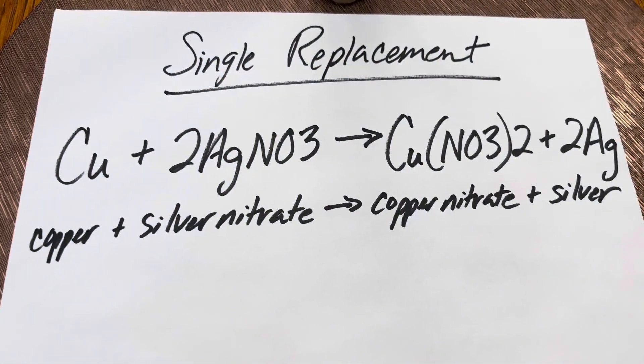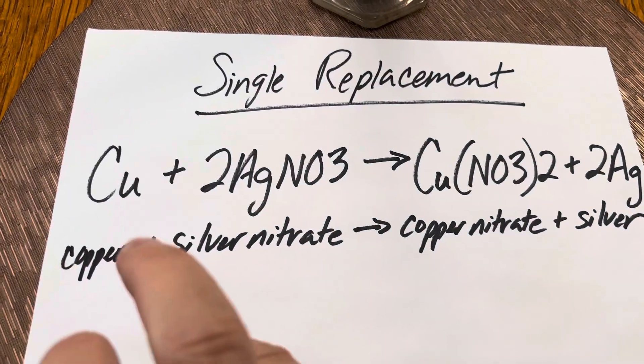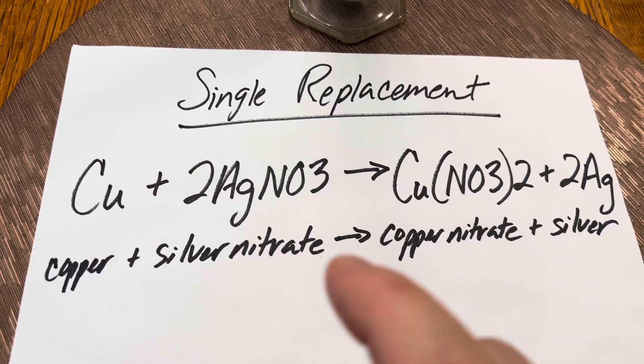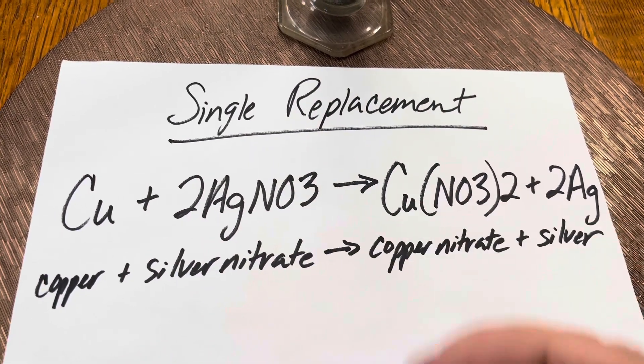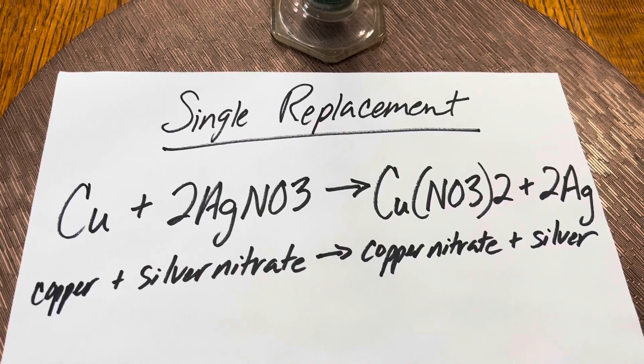This is also a redox reaction where the copper is oxidizing, it's giving up electrons, and the silver is reducing, it's gaining those electrons in this amazing reaction.